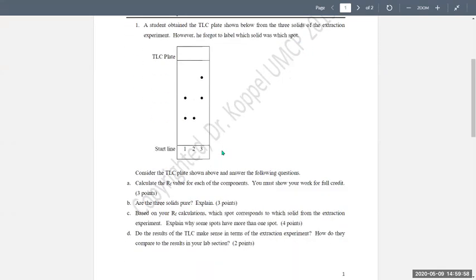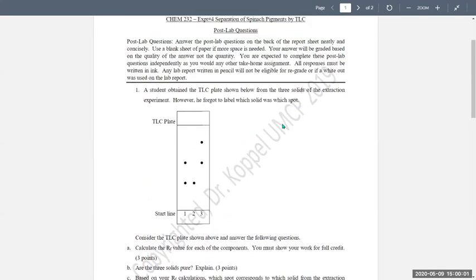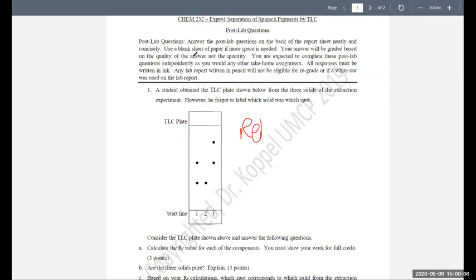So once again, as I said, this type of problem is valid. You can use relative polarities. So use, I believe it's the chart on page 34. You assess the functional groups and figure out what the relative polarity is, and then you can find the order here. And you can see there's 3 different RF factors that I could have, which match the 3 components.